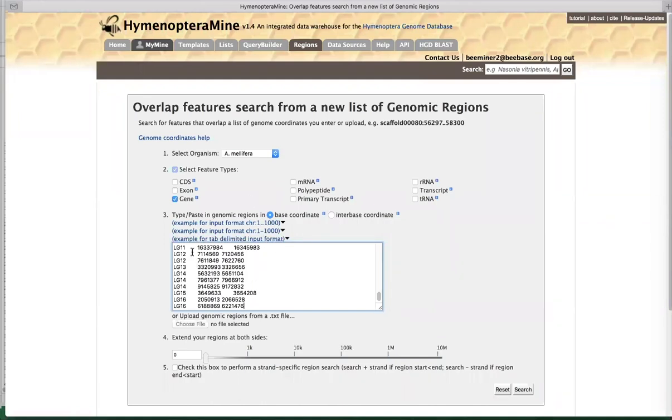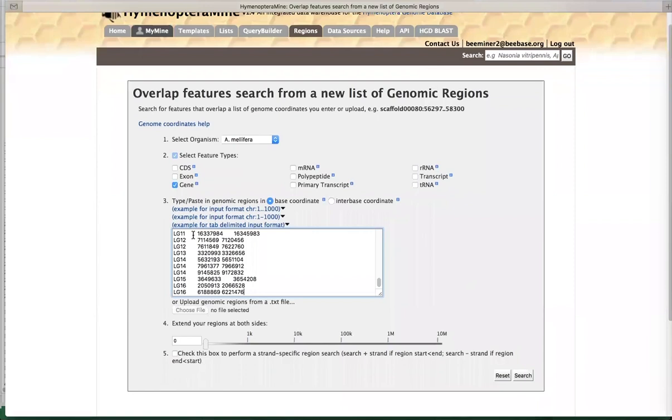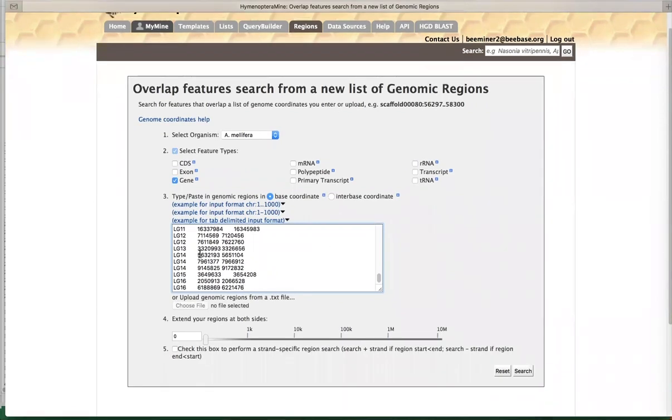You'll notice that these IDs, I'm going to show you later how to find out what your chromosome IDs should be, because of course we know that no matter what database you go to, there'll be a different format. I'll show you that in a few minutes. But we now try to follow what's available in the NCBI gene assembly report. So the current Apis mellifera assembly has IDs with LG numbers, like linkage group.